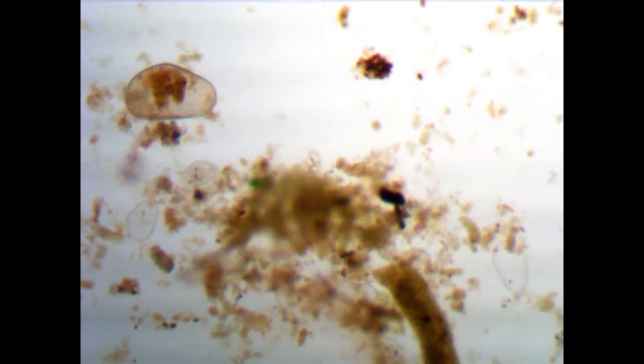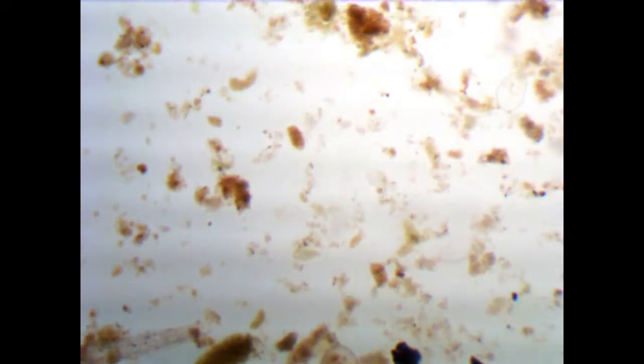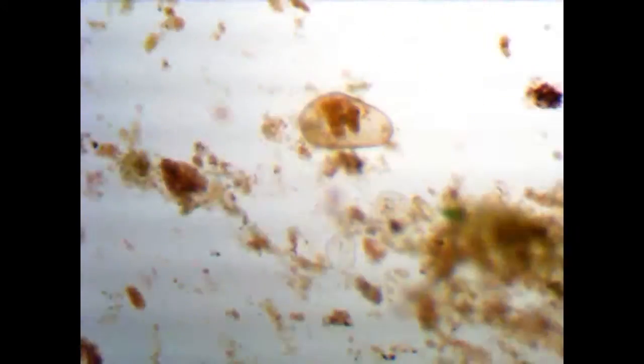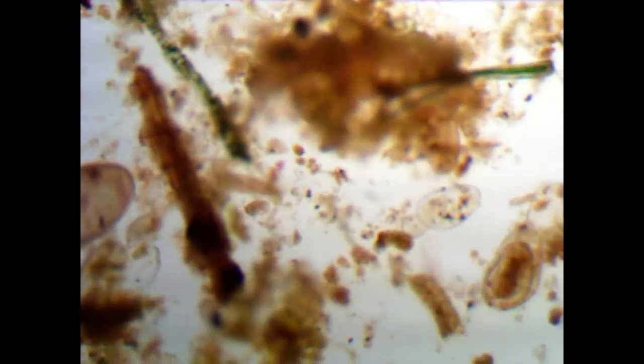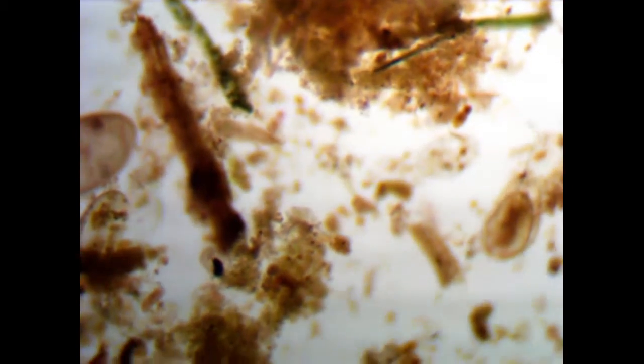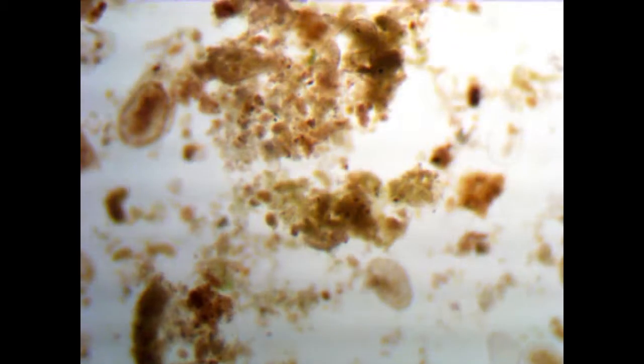So that was an interesting thing that I saw under the microscope. Those rotifers, which I don't think are the same type as the ones I mentioned in the first video, and the nematode looking creature, they're all very similar looking, and anybody who's had to take a lab practical in school knows that it can be difficult to identify all the key features, especially when they're still alive and moving. But I believe at this point we will be transitioning to the next sample. But before that, you have these interesting little rotifers and other organisms.